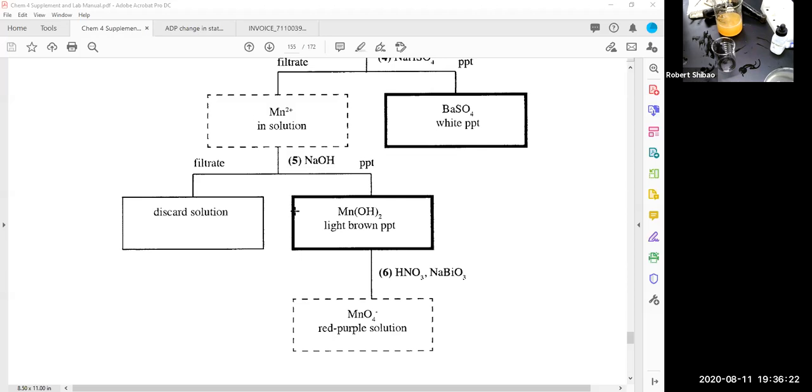It's pretty slow. If you look at the drip rate, that's pretty slow. And we still got liquid there. So this is telling me the filter paper is pretty clogged. This is going to take some time to filter.